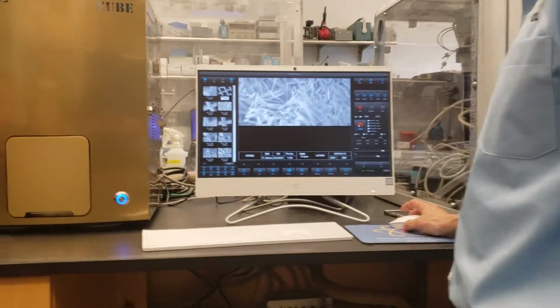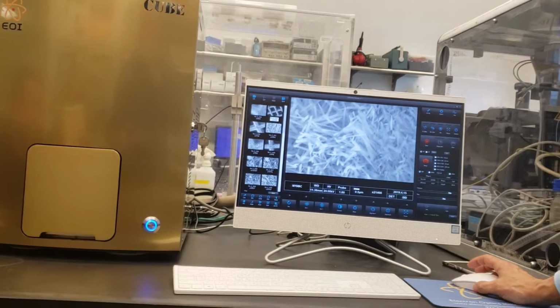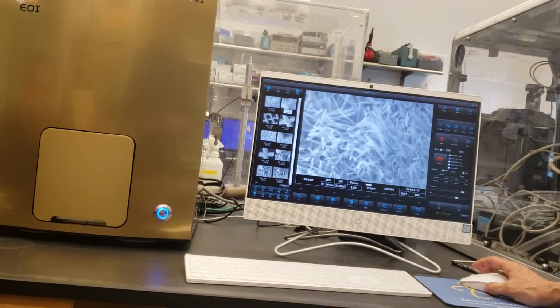What happens if we don't click save? Then it's not going to save it, so it will not be appearing. It won't be here. Yeah, I need to hit save for it to throw it up on this menu. As soon as I go save, see, it just threw that up there.